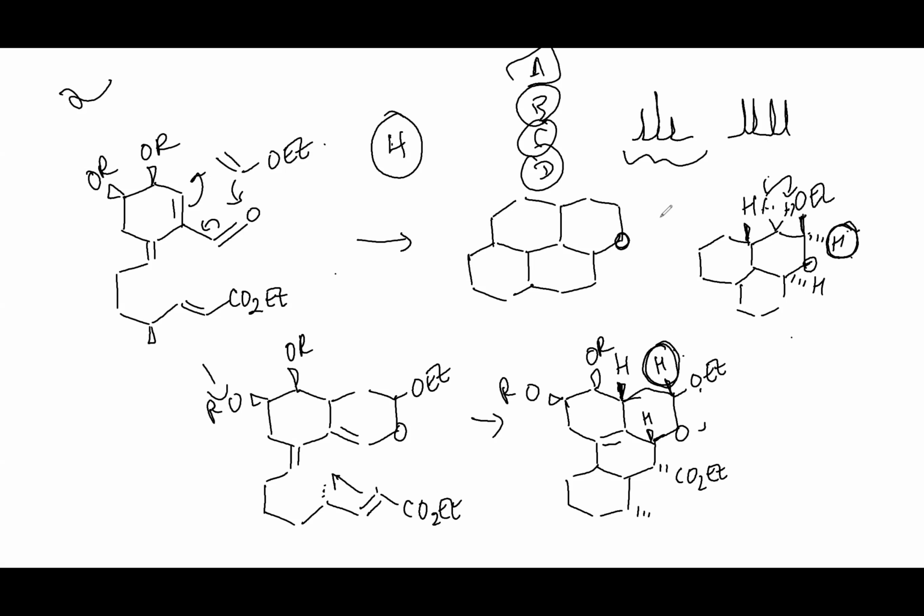When I separated them out, you could tell immediately which one we wanted. When I isolated the one I wanted, we got an X-ray crystal structure of it, and when we ran the NMR, it was a beautiful doublet of doublets. Every other example I did, which was the wrong diastereomer, always showed up as a triplet. So you could look at the spectra and immediately say, if it's a triplet, bad; if it's a doublet of doublets, good.